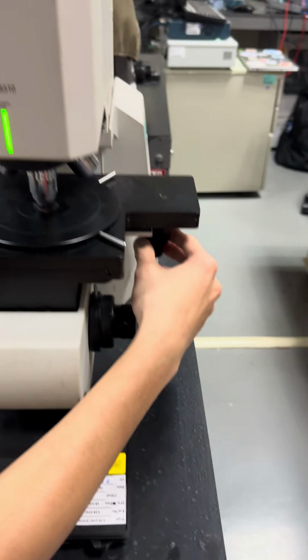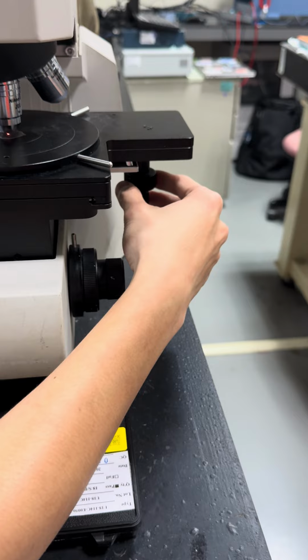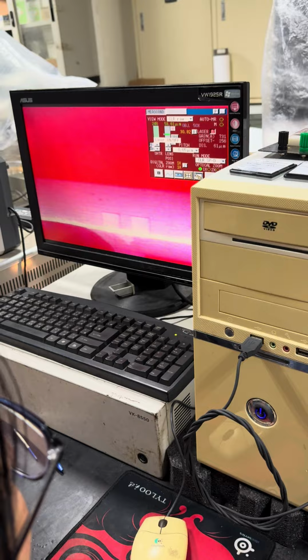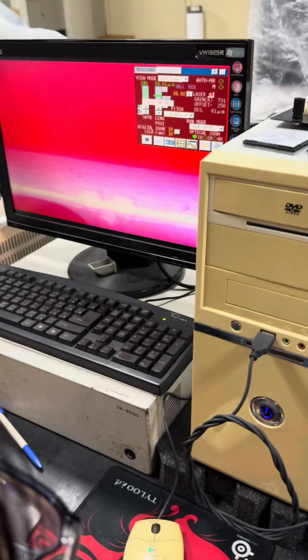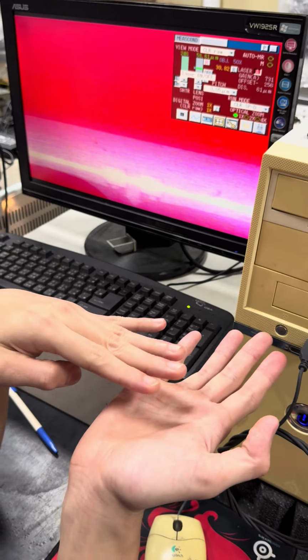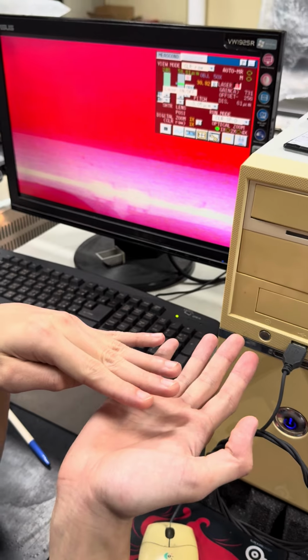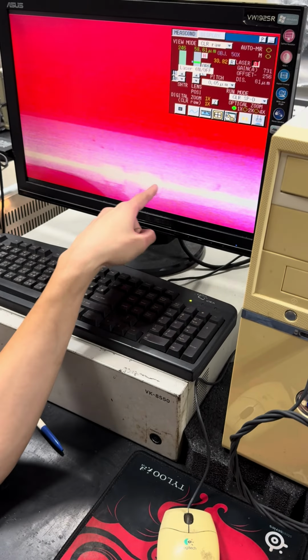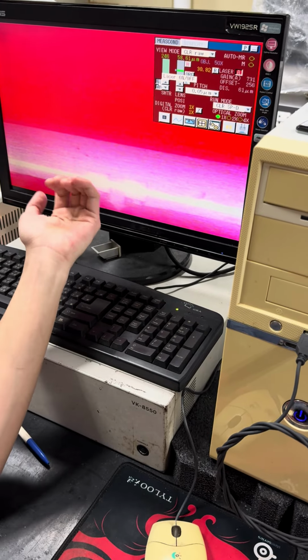And we're gonna change the laser beam focus to the object we want to take the measurements. In this tutorial we will try to measure the height of the pad with the substrate. So the object will be the pad, the electric pad.